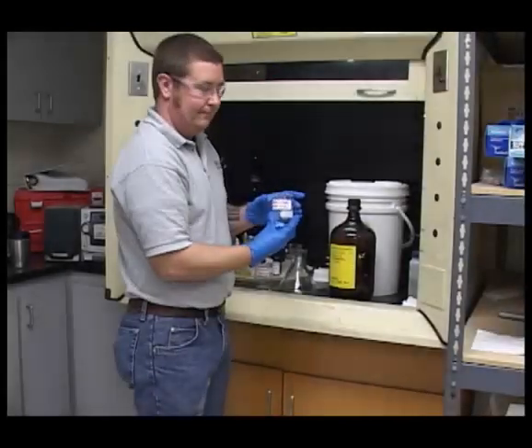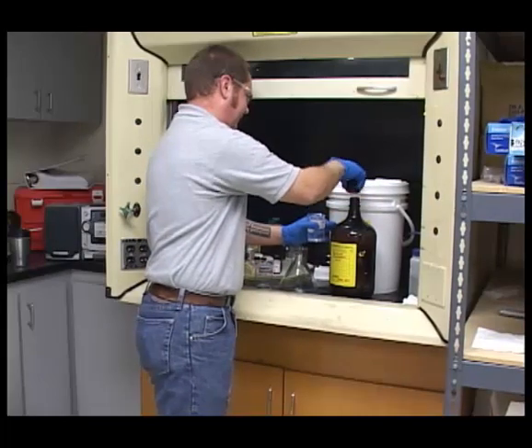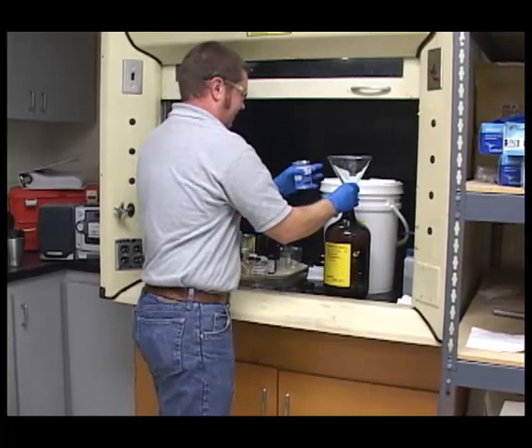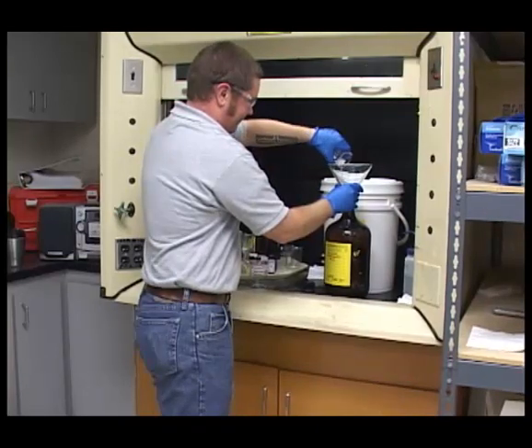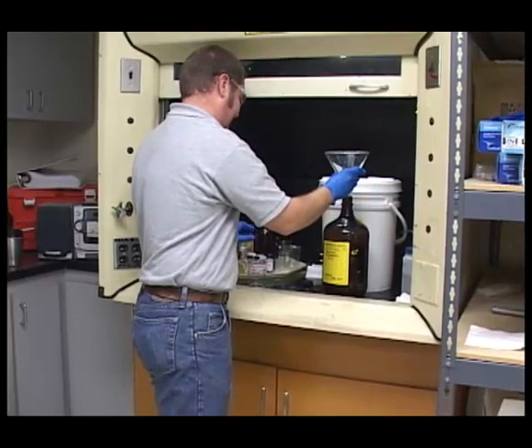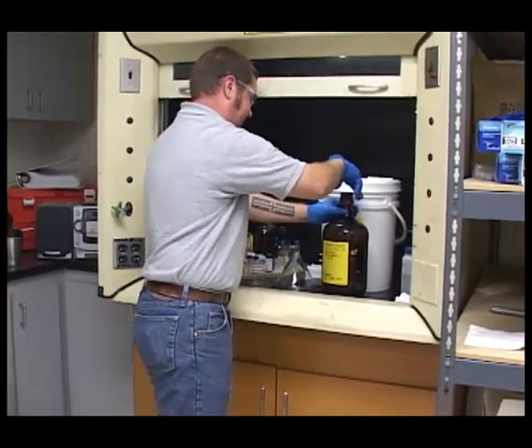Now, if an hour and a half later, someone else comes to the satellite accumulation area and they have a beaker full of, say, water, methanol, and sulfuric acid, they may simply add this compatible mixture to your container and then update the list of constituents to include these new additions.